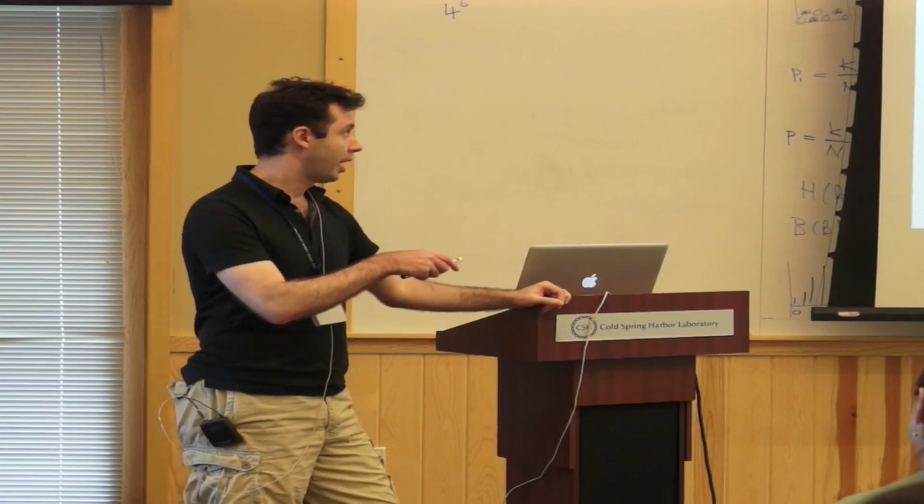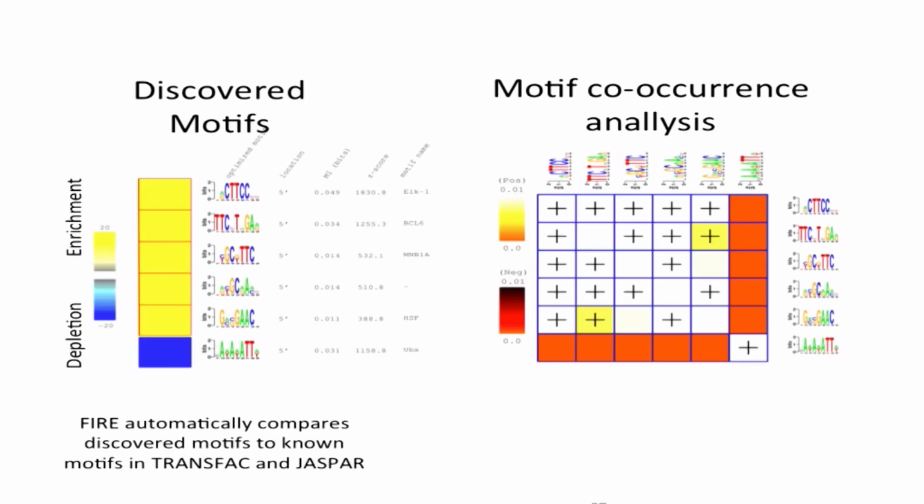Yeah, and that's in fact what's happening here. You see ELK1, an ETS family transcription factor. It belongs to a family, and they'll pretty much all bind the same sequence here. So when we compare this motif to the database of motifs, the ELK1 motif comes up first. But if you were to look at the second best, third best, fourth best and fifth best, they would all be members of the same family. And this one won by just a tiny bit.